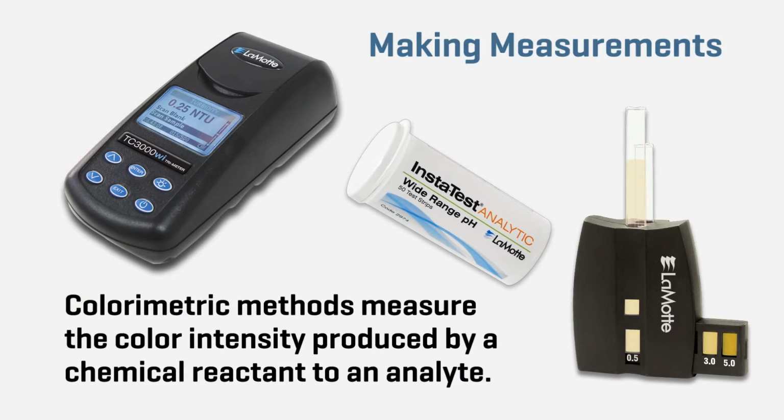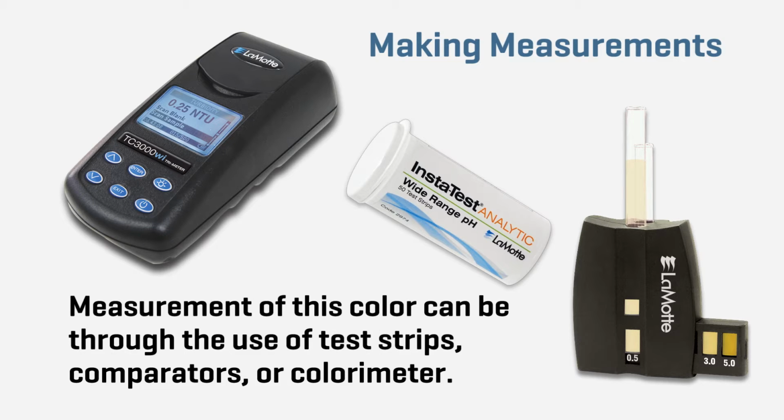Colorimetric methods measure the color intensity produced by a chemical reactant to an analyte. Measurement of this color can be through the use of test strips, comparators, or a colorimeter.